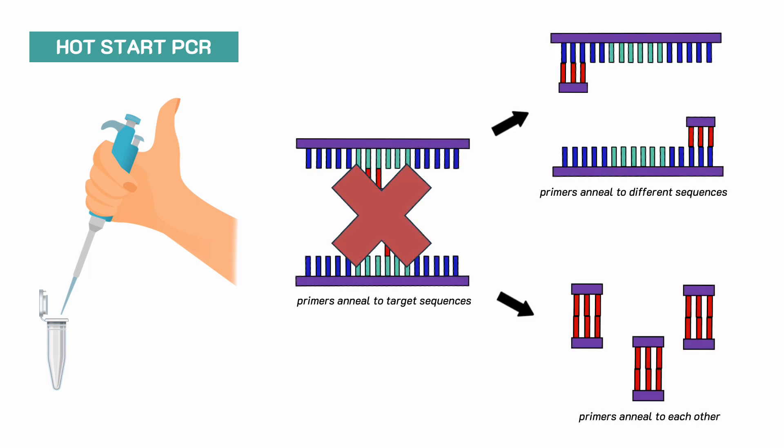During the PCR setup, when we add the necessary components for the reaction, primers can bind non-specifically to each other or to different DNA sequences. DNA polymerase can then extend these sequences and we can get an unwanted non-specific product.